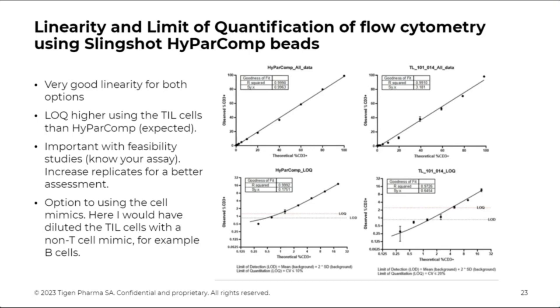And this is because it's cells that we are working with. It's not completely the same distributed, and you always get some variation when you work with real cells. Here, the LOQ, if we would have put that to 10%, we would have ended almost at 20% to be the LOQ. Here, because it's a feasibility, I don't have any predetermined criteria. I said, okay, a CV of 20% will do. So the LOQ was put to close to 3%.